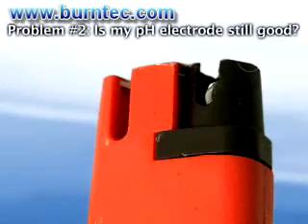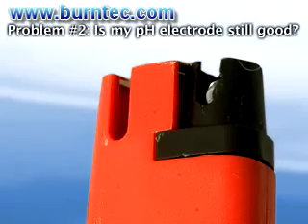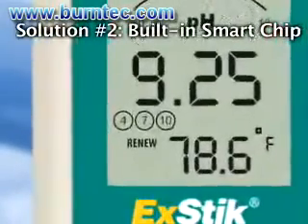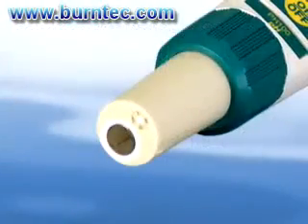Problem number two: uncertainty of not knowing how long the electrode will last and also the shelf life of storing an electrode. Solution: the built-in smart chip alerts the user when to replace or refill the ExStik pH electrode. A renew indicator will appear when the meter senses the electrode not delivering optimal performance.